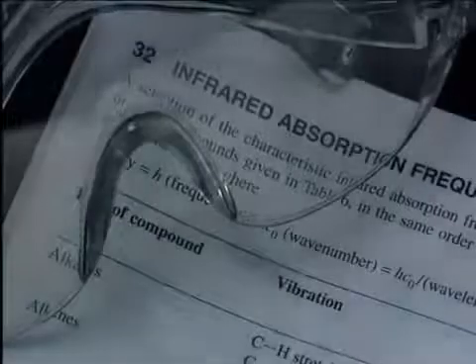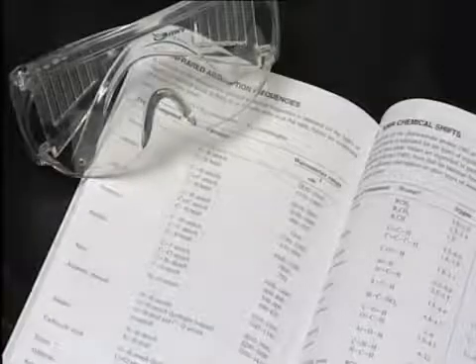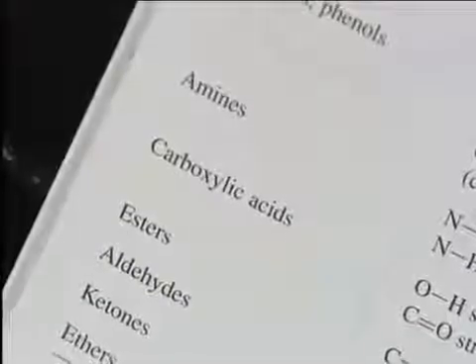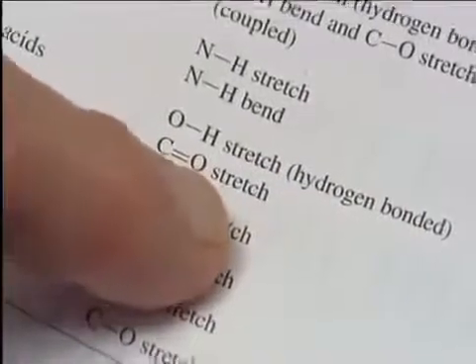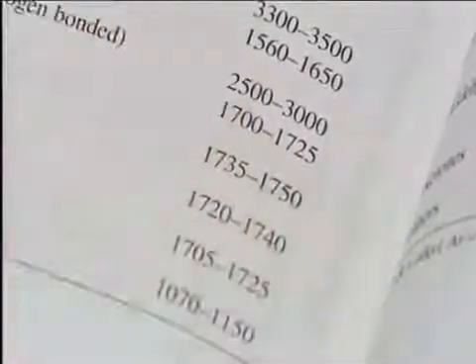Each bond, such as OH, C=O, NH, and so on, absorbs at a particular frequency, and this allows it to be identified. For historical reasons, and because the numbers are easy to work with, chemists dealing with IR spectra use units called wave numbers, measured in cm^-1, which are proportional to frequency.